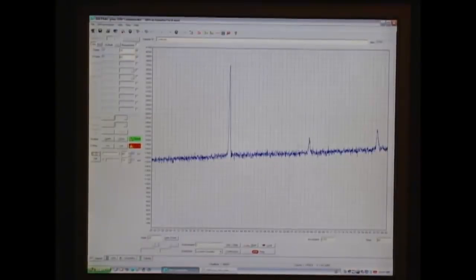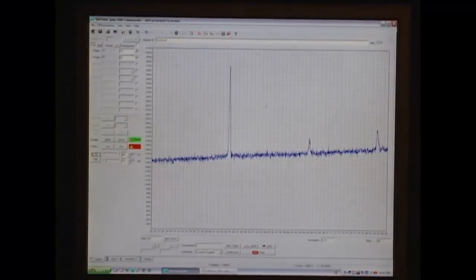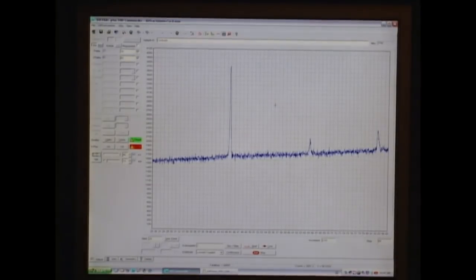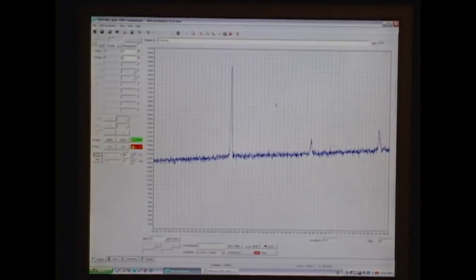So, if I run a scan from this window, I can get a perfectly good scan, I can run the standard or I can do a quick scan, whatever I want. However, this data will not automatically be saved. In order to automatically save data, I need to set up a parameters file and then call that parameters file in the jobs tab.